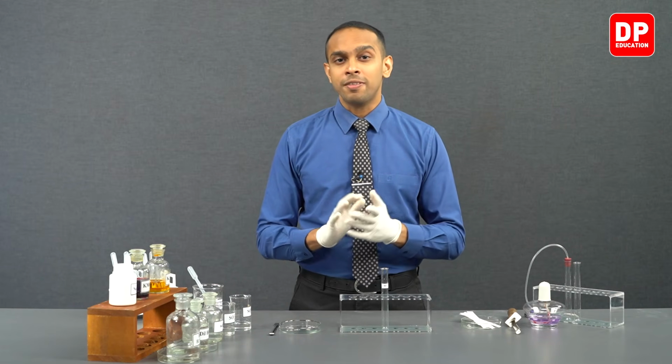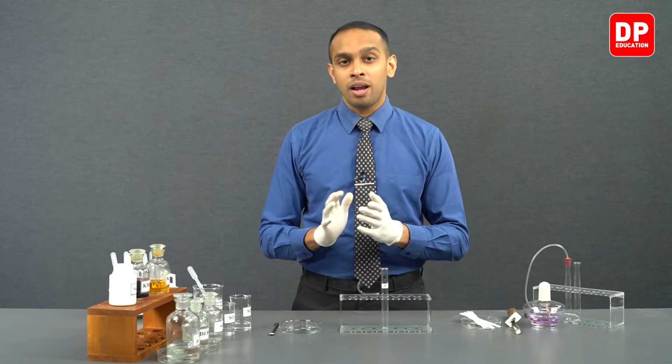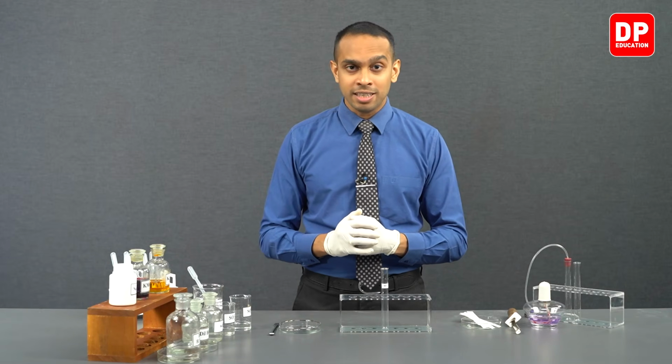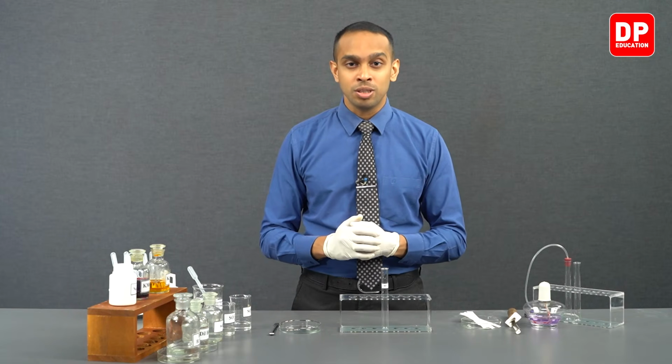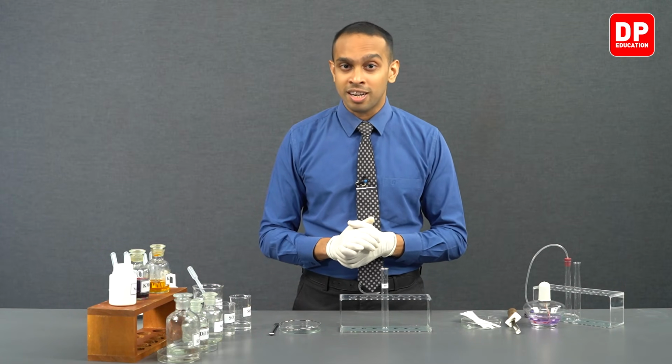So sulfur dioxide, when it comes into contact with acidified potassium dichromate or acidified potassium permanganate, both of which are good oxidizing agents, will get oxidized to form sulfate ions, and these oxidizing agents will get reduced. As these oxidizing agents get reduced, they will give us a color change.